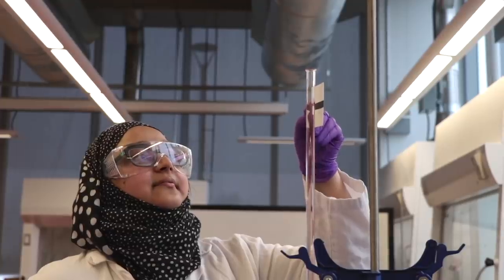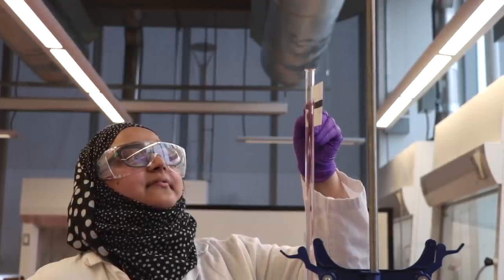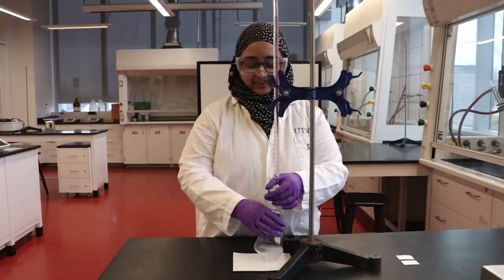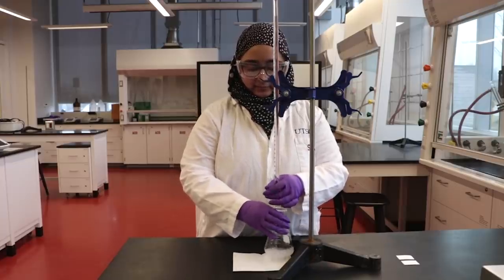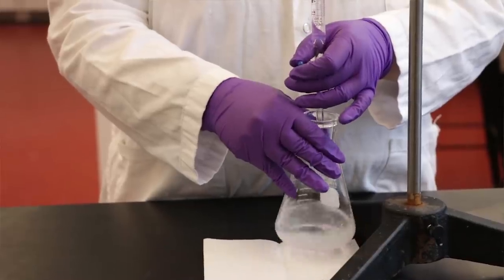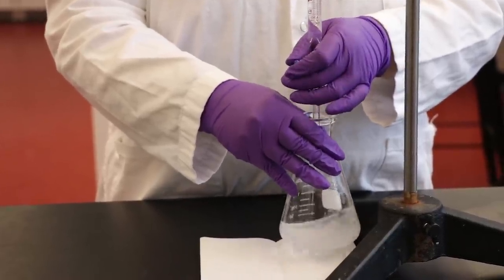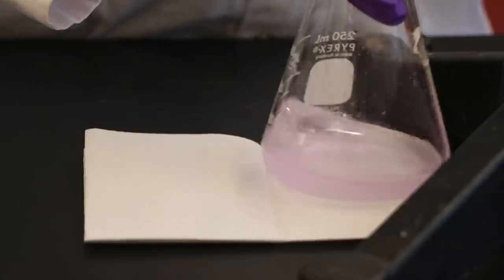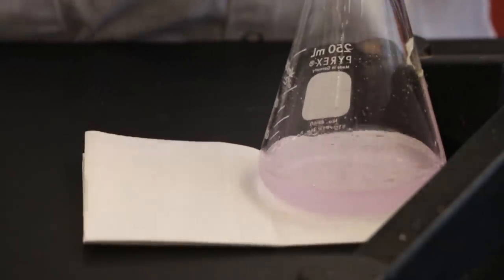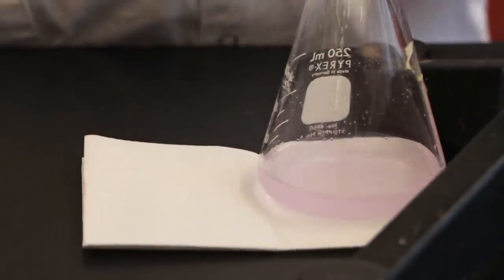Titrate using the standard NaOH that was added to the burette. Remember to record the initial and final burette readings to two decimal places. The endpoint of the titration is indicated by a pale pink color.